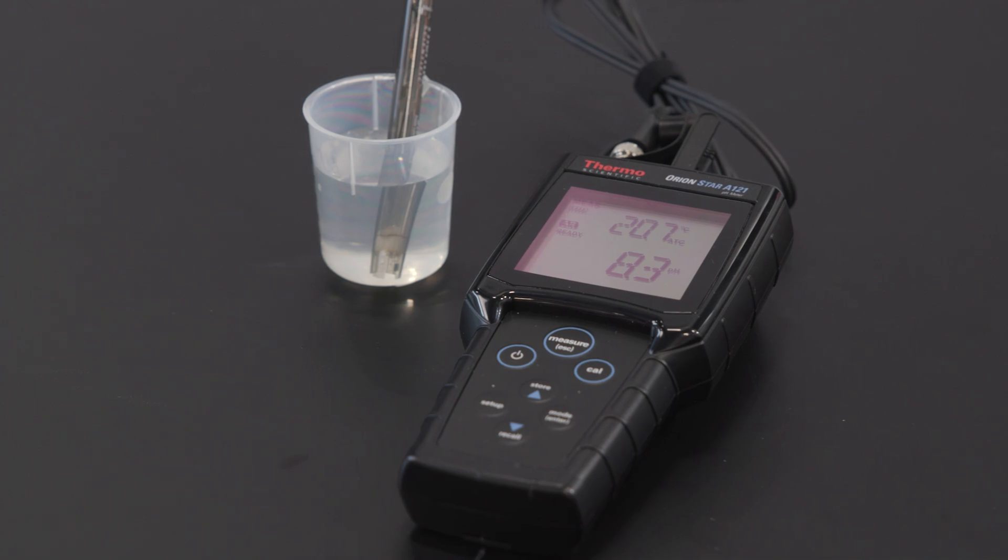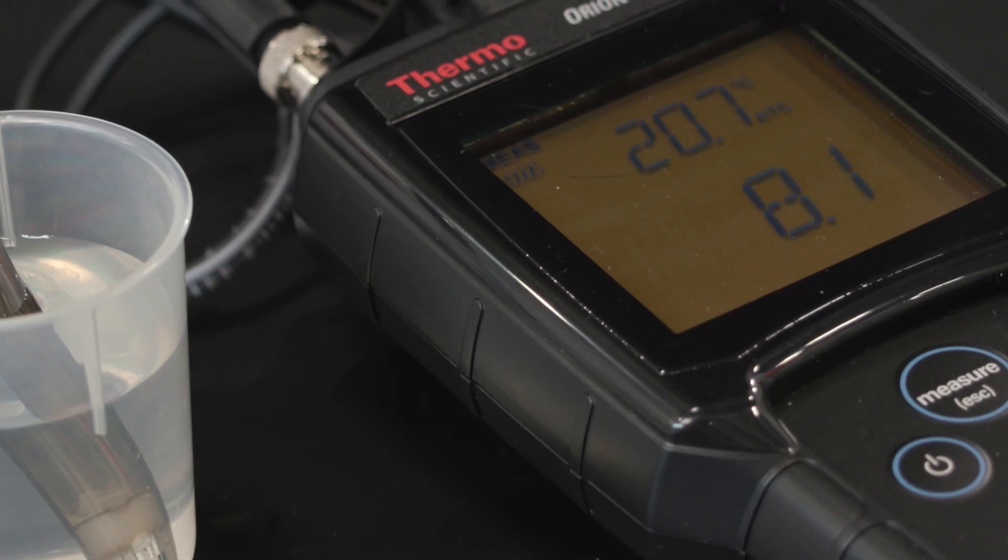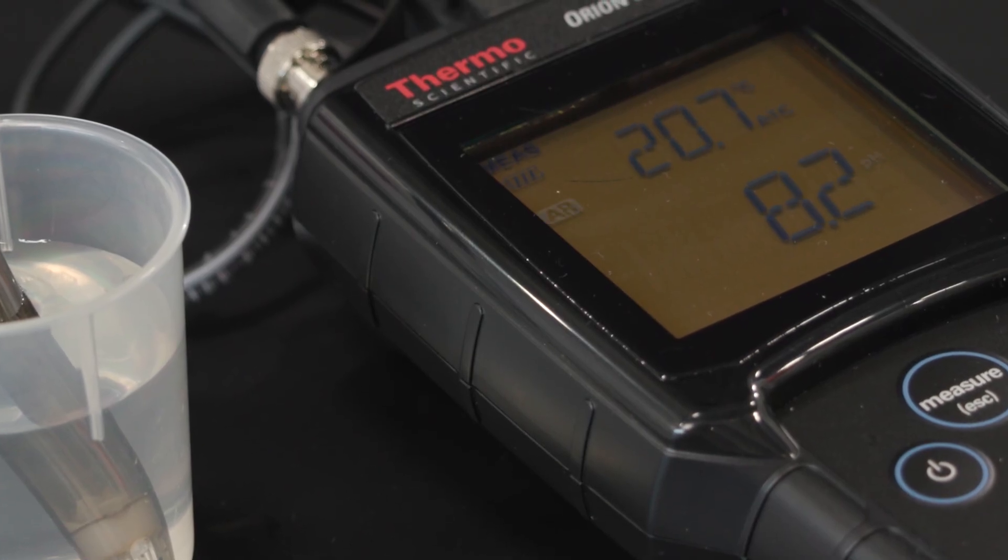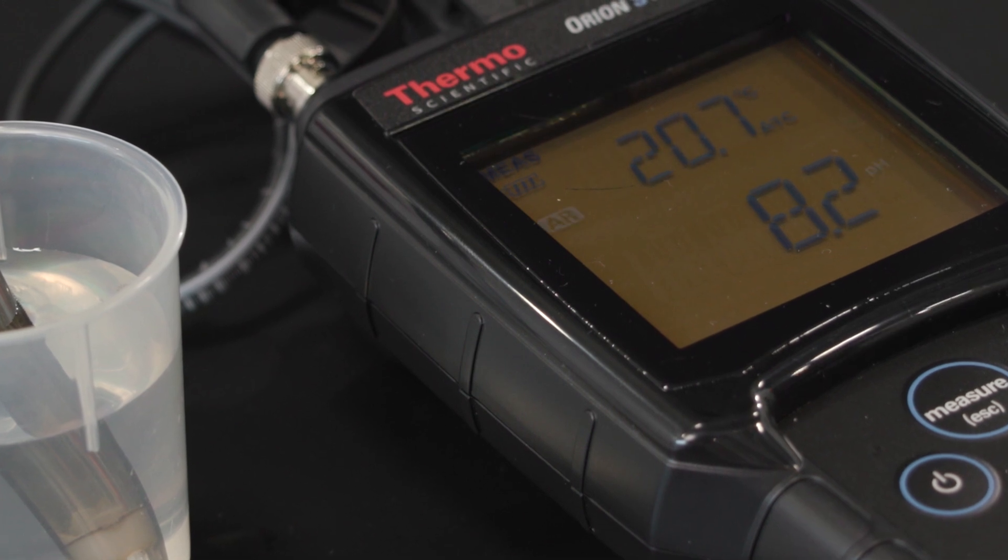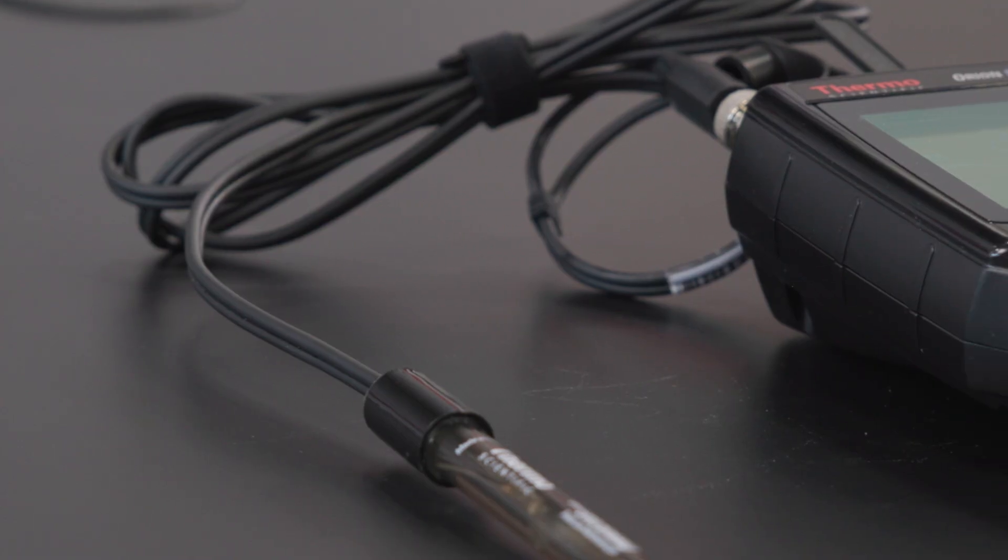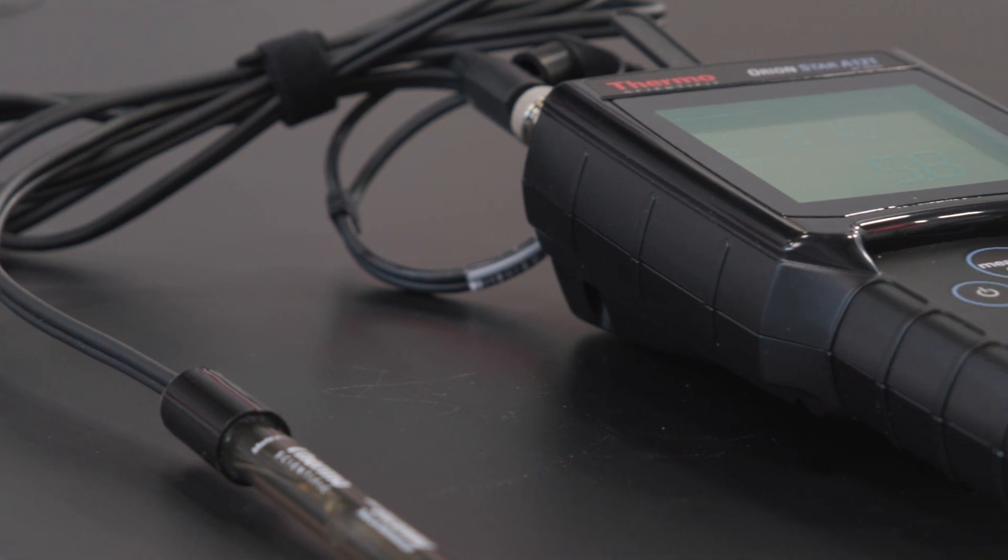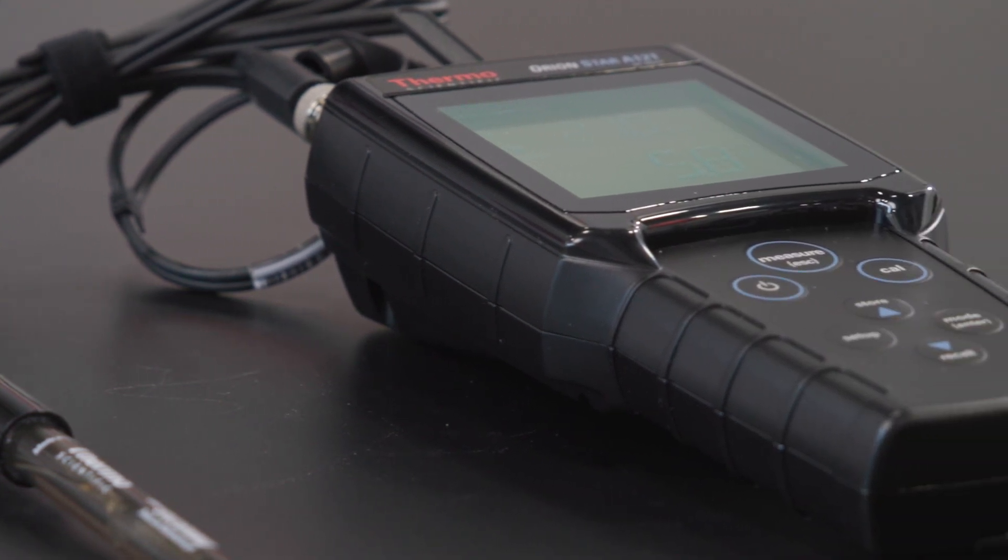If accuracy is important to you, look for a meter with automatic temperature compensation. Since temperature influences pH during calibration and testing, a meter with automatic temperature compensation can provide more reliable results.